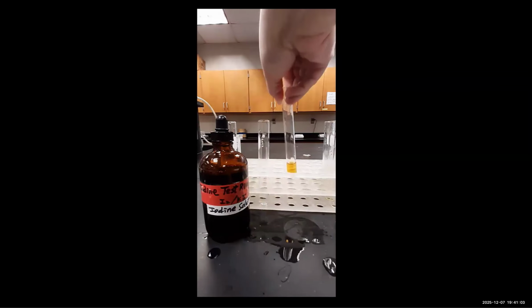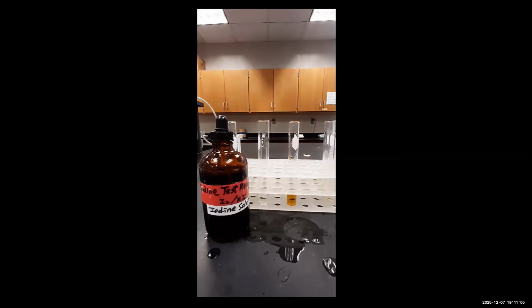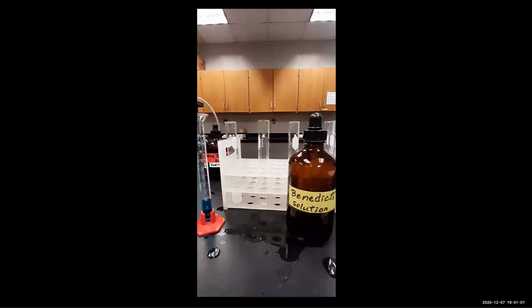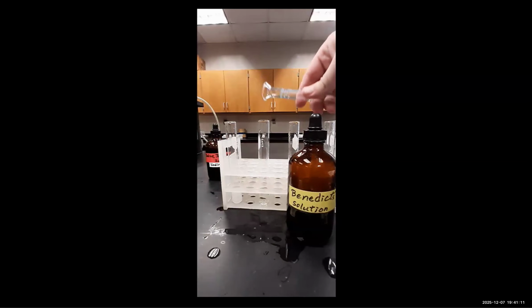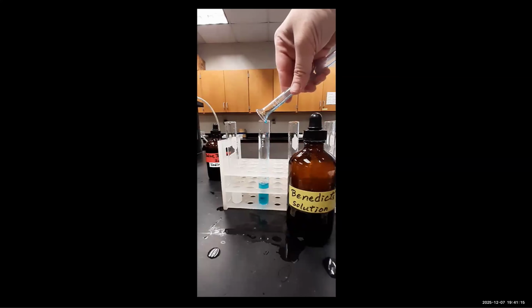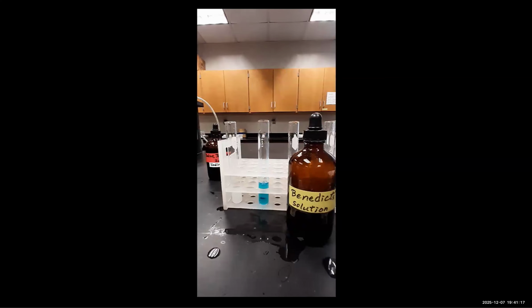Okay, let's now take a look at the glucose test. So we're testing for glucose in the beaker water after 30 minutes using Benedict's reagent. Remember, this reaction requires heating, so we're going to see what happens after we heat the sample.